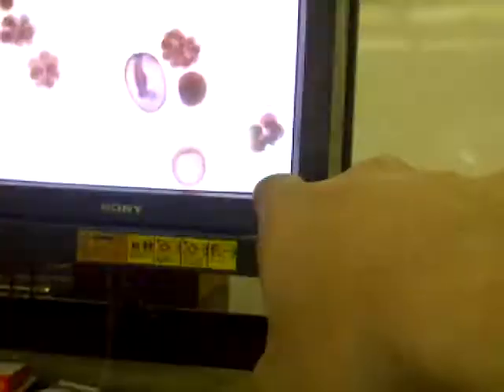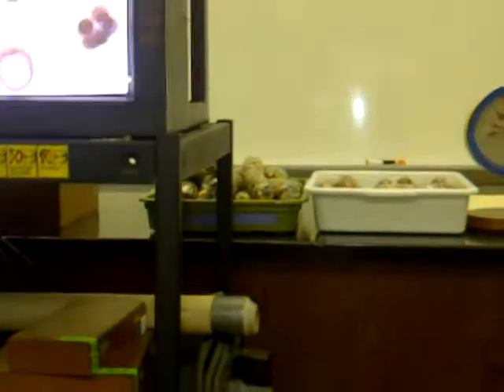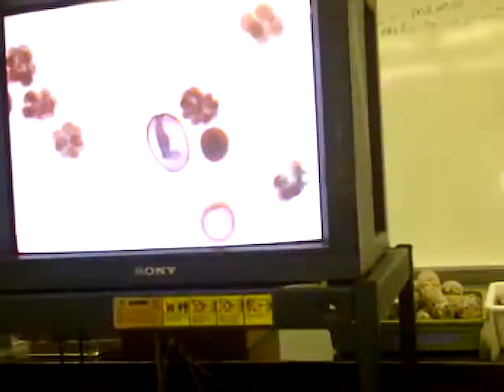The bottom cell there, that's just this cell right here, the bottom here, that just started. Are you ladies interested in early gastrula? That's the bottom one right there, right? Yes. What's up? Slides for endo.